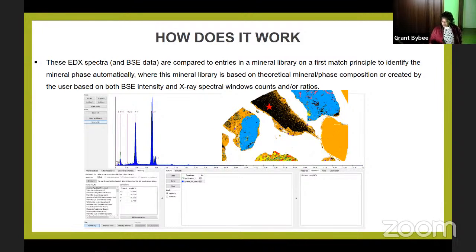It helps a lot because sometimes you can judge, based on the spectra, that the minerals present here are actually not what you know. And then in that case, you can add your own. Roger did a lot of that by adding the clay minerals, because some of them were not present in our database. So it's very, very important.